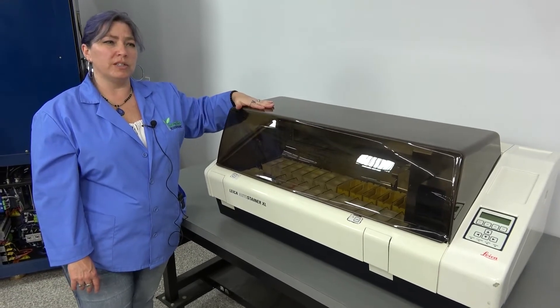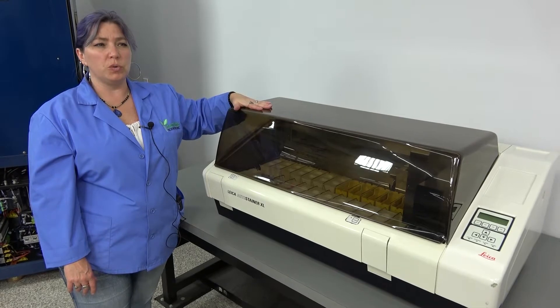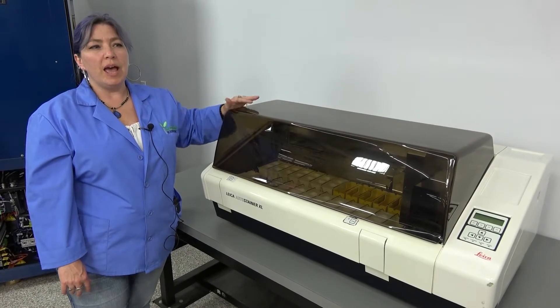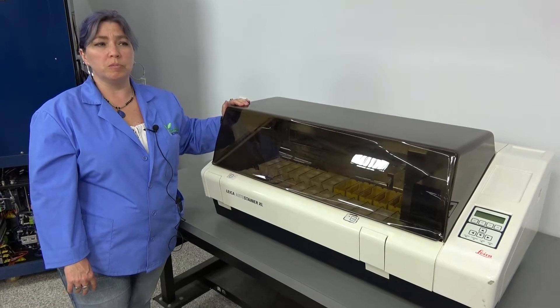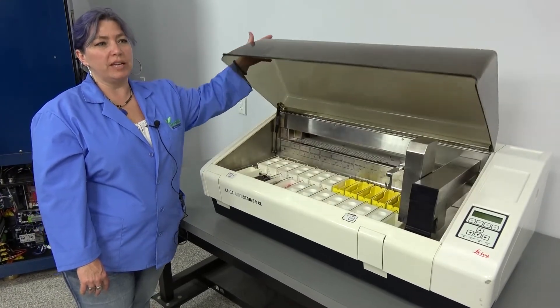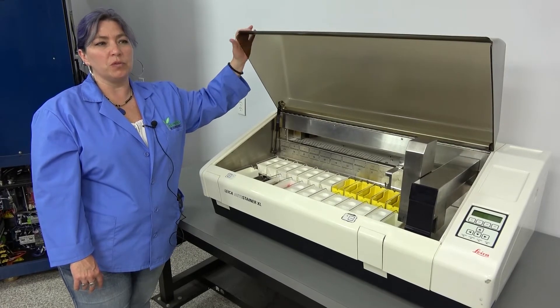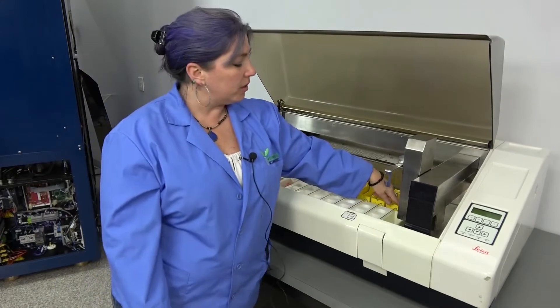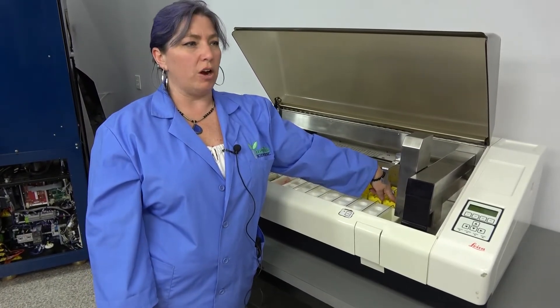This particular auto stainer stains between 150 to 200 slides per hour. It's an easy to use, menu driven and microprocessor controlled machine. It has spaces to use 18 reagents, space for 5 wash stations, and it also has a heater that is integrated with hot air.